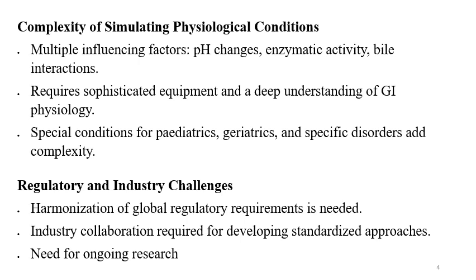Complexity of simulating the physiological conditions. Multiple influencing factors are there, like pH changes, enzymatic activity, bile interactions, and these require sophisticated equipment and a deep understanding of GI physiology. Special conditions for pediatrics, geriatrics, and specific disorders add to the complexity.